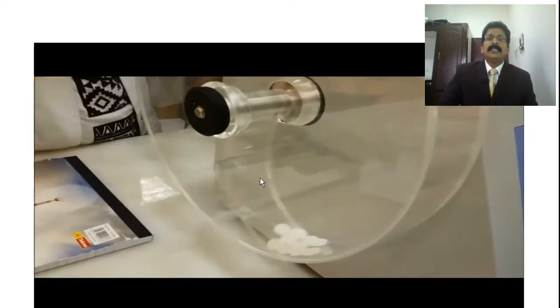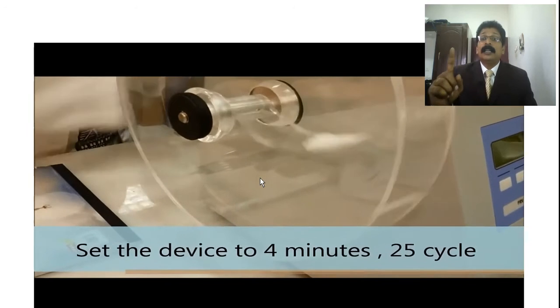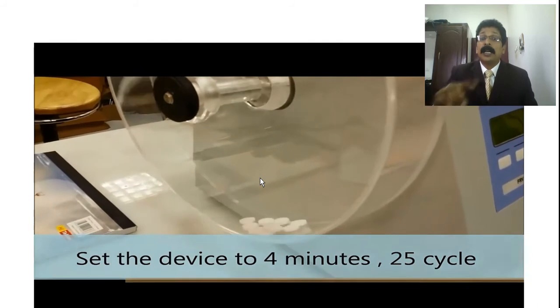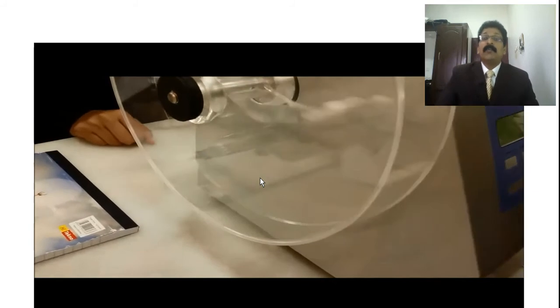And then you can see the rotation you have just put on. According to the procedure, you need 25 rpm for 4 minutes. If you keep to the procedure, 100 revolutions will take place. So we are just waiting for 4 minutes, only 4 minutes.